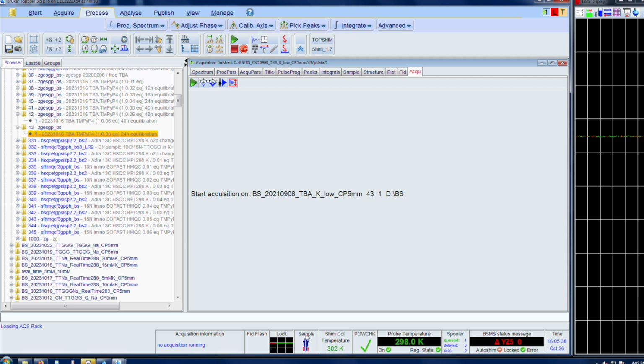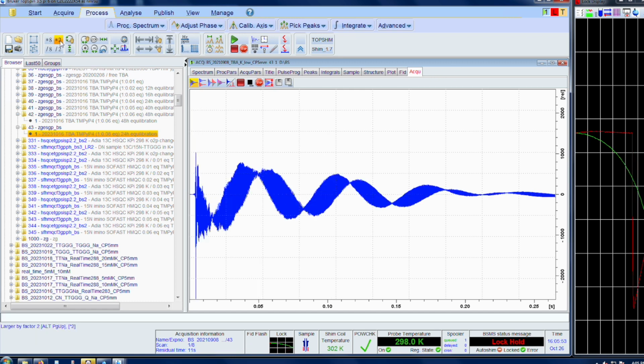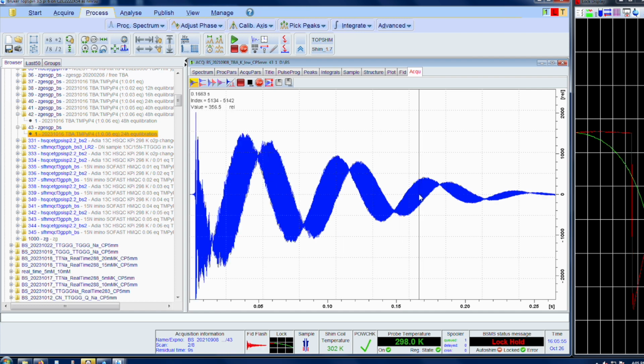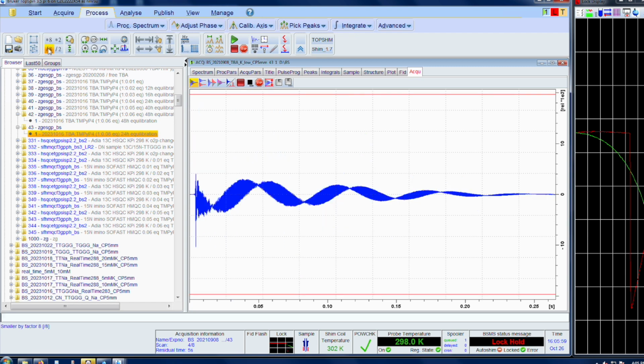The first thing that we are doing here is to look at the spectrum to see whether you get any signal. So it's just starting all the electronics. This 1D will take about 20 seconds. And you can actually see the real-time acquisition of the FID on this screen if you click acquisition. The FID is being collected as a function of time, and since the number of scans is increased, the signal keeps adding up. So this is signal averaging.